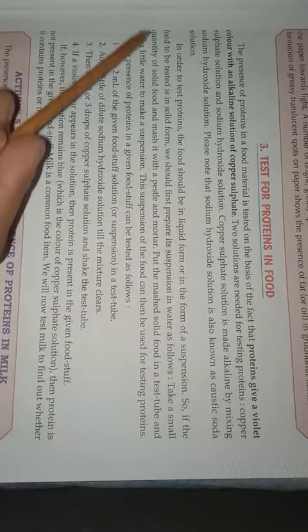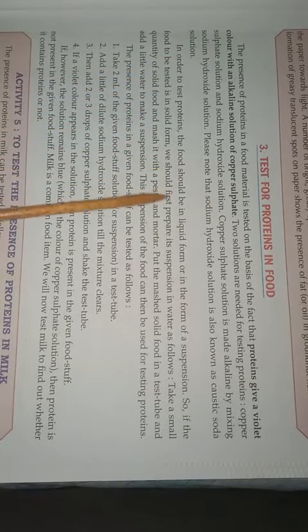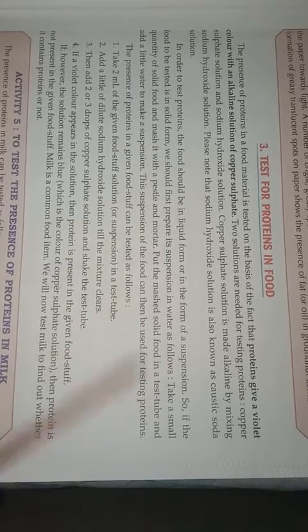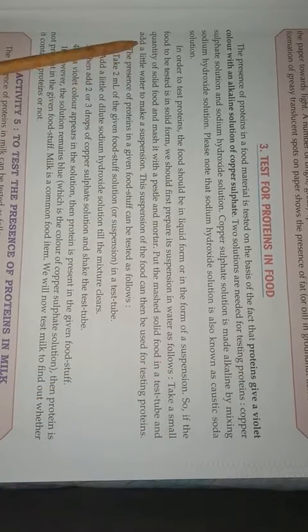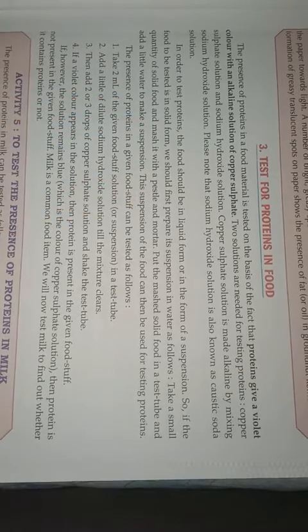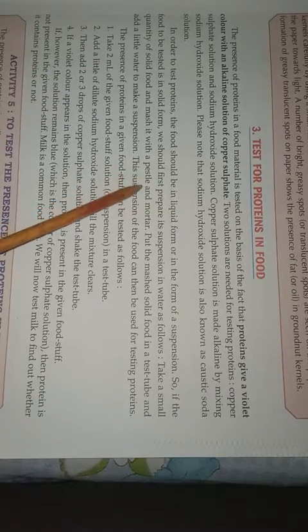If the food to be tested is in solid form, we should first prepare its suspension. What do you have to do? Take a small quantity of solid food and mash it with the pestle and mortar.